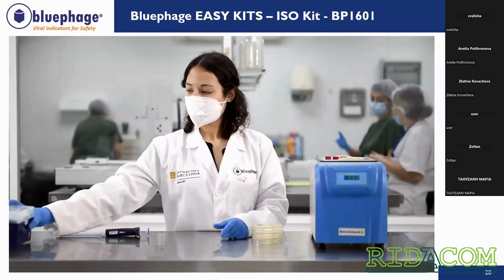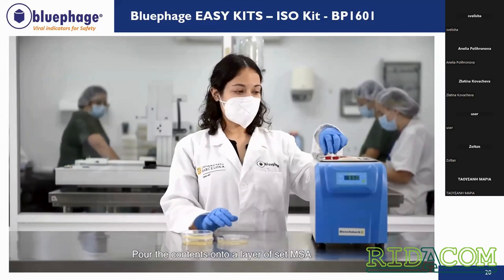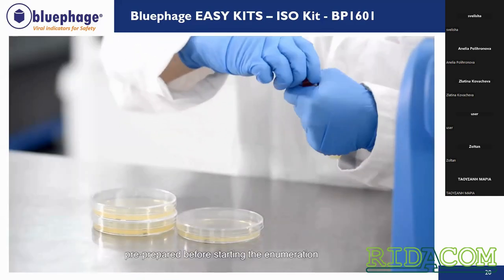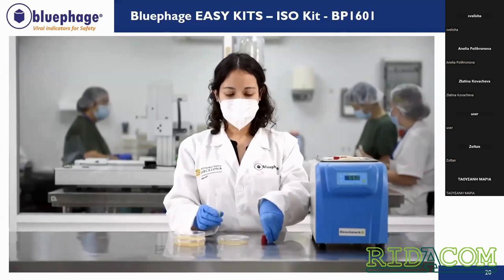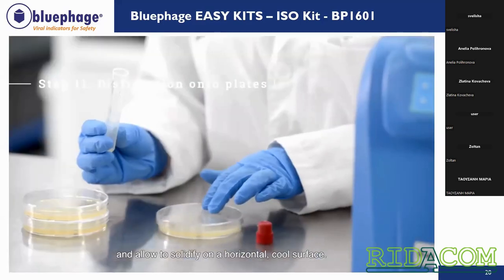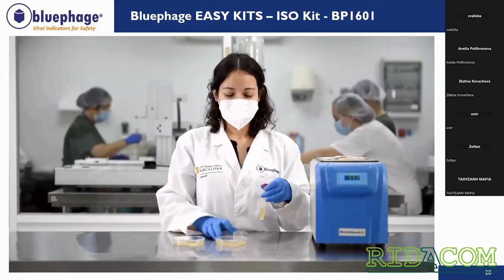Okay, you will see that she mixed it gently, and we will pour our test tube on top of the layer of MSA. So as you can see, she's mixing very carefully, and she will pour now on top of our MSA layer. We need to distribute evenly, so it's really important to allow the solidification in a horizontal cool place.